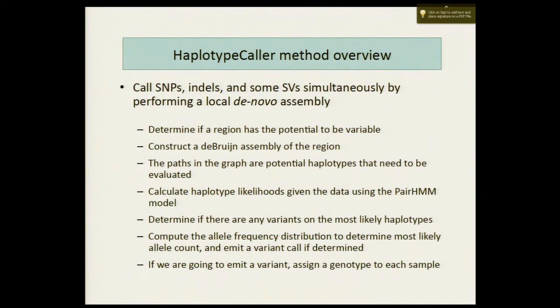One way that the indels wouldn't be called in unified genotyper is if there aren't concordant alignments. You come to a locus, and unless there are X reads which have that exact same indel, it's not going to be a proposed indel. Unless you have 5 reads at the site all with the same indel, you're not even going to propose that as a possible indel. That would be one reason why it wouldn't be called with the unified genotyper, but maybe it would be called with the haplotype caller, because it'll show up in the assembly graph. You'll say it's a possible haplotype, evaluate its probability, and potentially it's an indel that you call. So maybe.